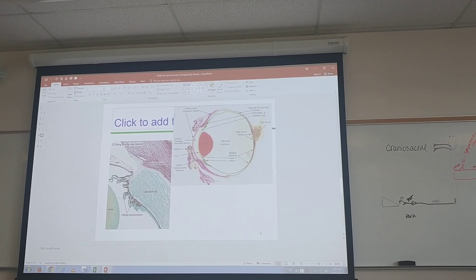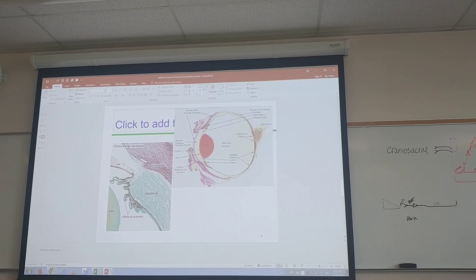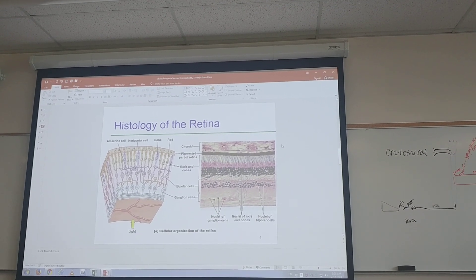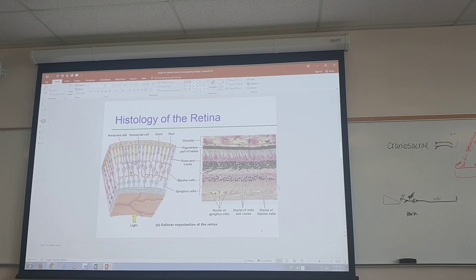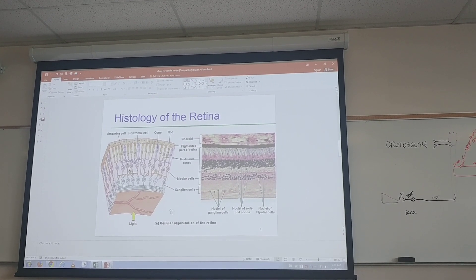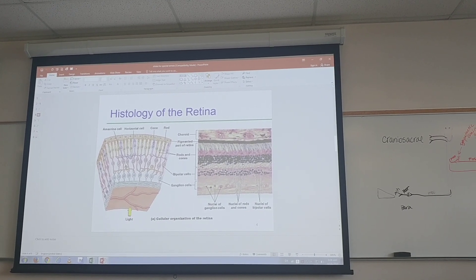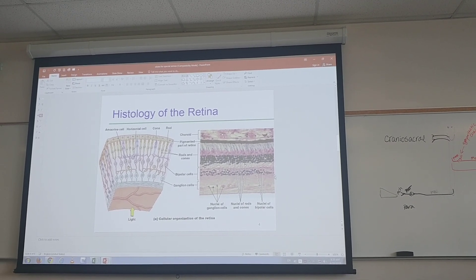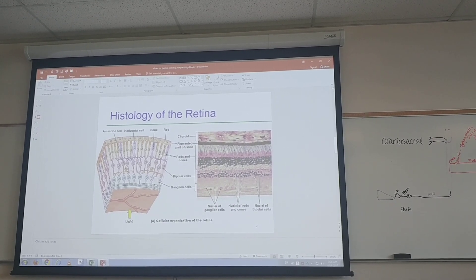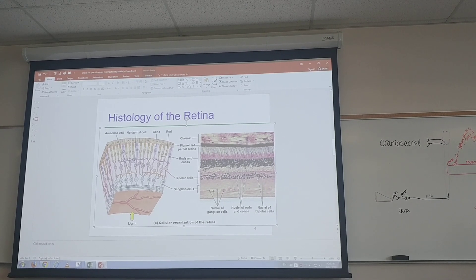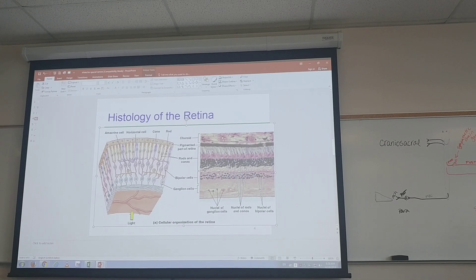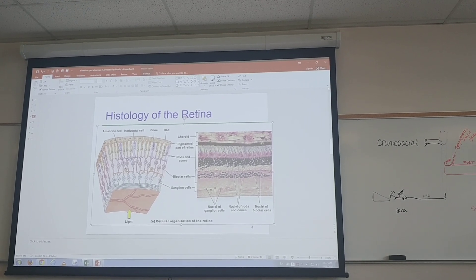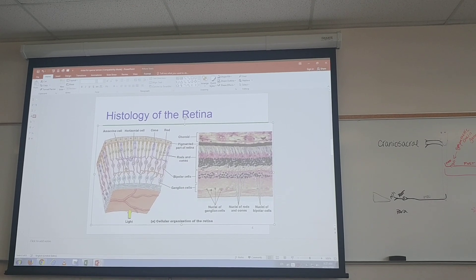We can also take a cross-section and look at the retina. When we take that cross-section, we're going to look from the light side all the way through and find three layers of cells. First, cells that are very lightly stained — it's mostly axons, those are the ganglion cells. Next is bipolar. Then rods and cones — the photoreceptor cells — which will look really thick. And then a nice dark black layer, that's your pigmented epithelium. So the layers are: ganglion, bipolar, rods and cones, and pigmented.